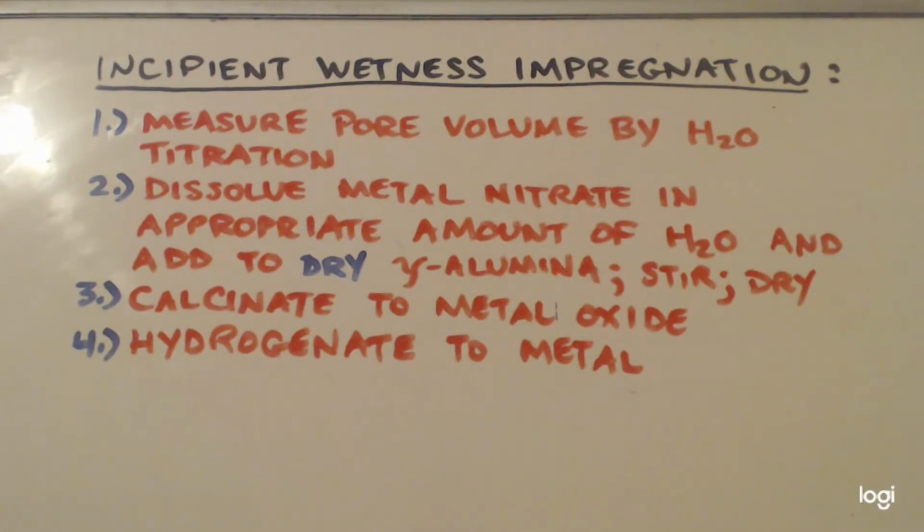You want to start under 20 mils, and let's say you're using copper, you'd put copper nitrate, the amount you want, into the water. Dissolve it completely, then put some more water in so that the volume comes up to the 20 mils that you wanted. You don't want to start with 20 mils because when you add in your metal nitrate, your copper nitrate, it's going to raise the volume up. So you want to have less water. Then once you dissolve your nitrate, you can add the appropriate amount of water up to the 20 mils, or whatever you want.